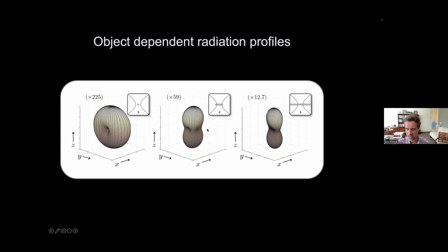So how do I interpret this? Well, I see there's signal going up. There's also signal going down, but there's no signal going towards the left and right. Okay, so the lateral contributions have been destructively interfered out. Look at this peanut shape. That's the emission profile. If I extend it, I get even more peanutty.